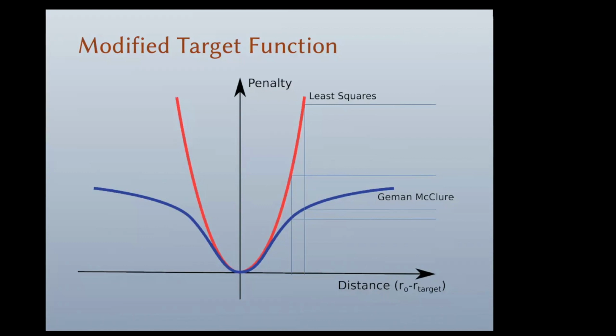So the idea is we move between those two pale blue lines, and as a consequence of doing so, we get to change the penalty that we pay for the atom being in that new position. So using least squares, you can see the top rectangle. This is quite a substantial increase in the penalty score as a consequence of moving the atom in that way.